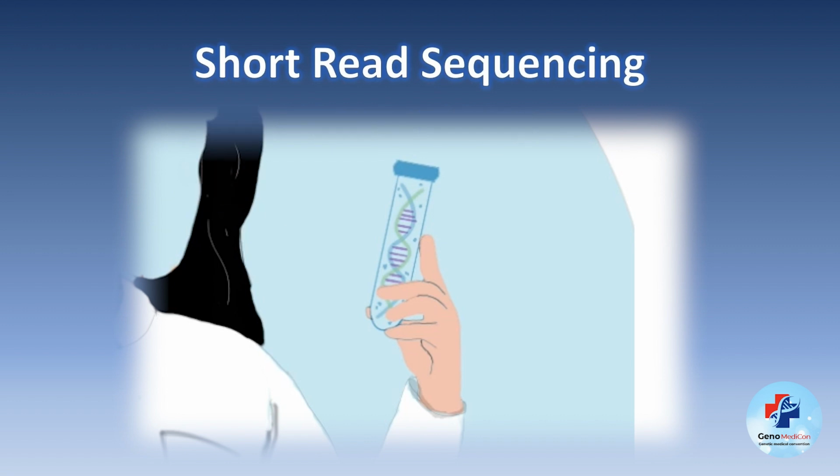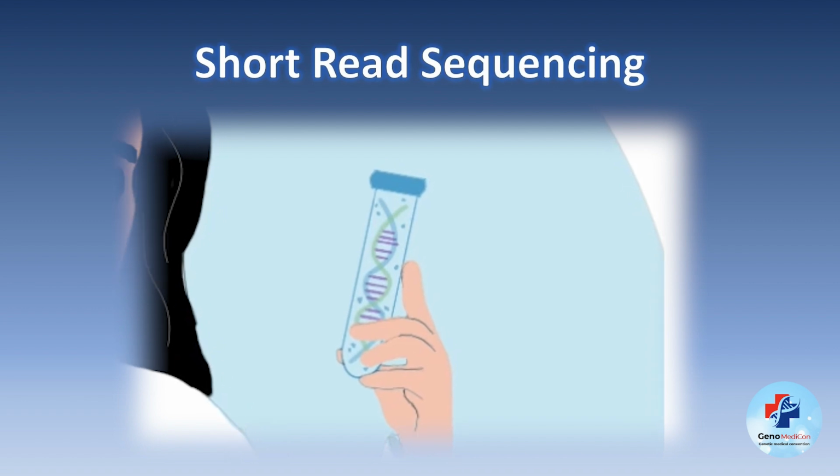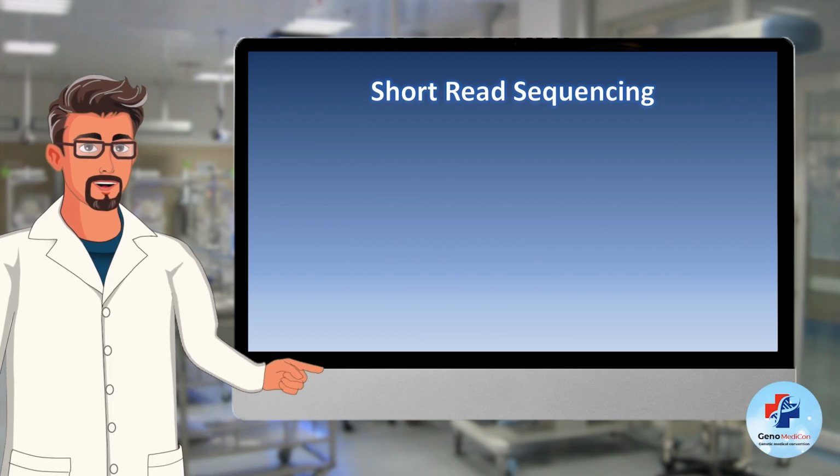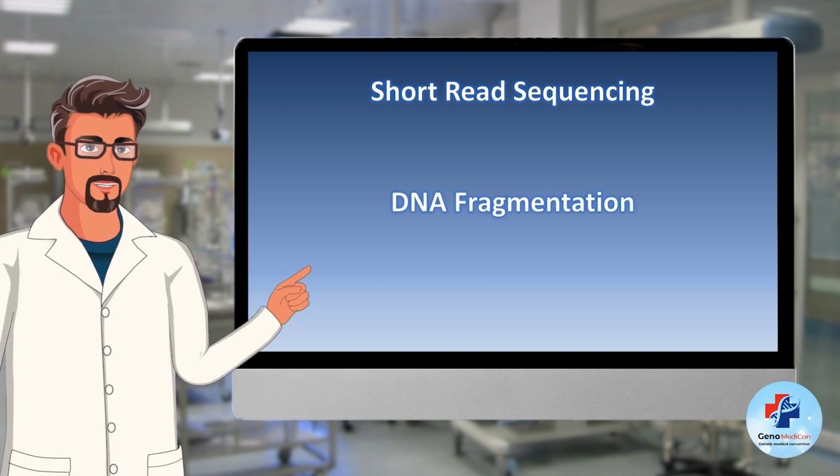If you have any questions, or if you are simply curious about how DNA is extracted and purified, you can watch our video on DNA extraction. Okay, once the DNA is isolated, it must be fragmented into smaller pieces to fit the short-read sequencing platform's capabilities.